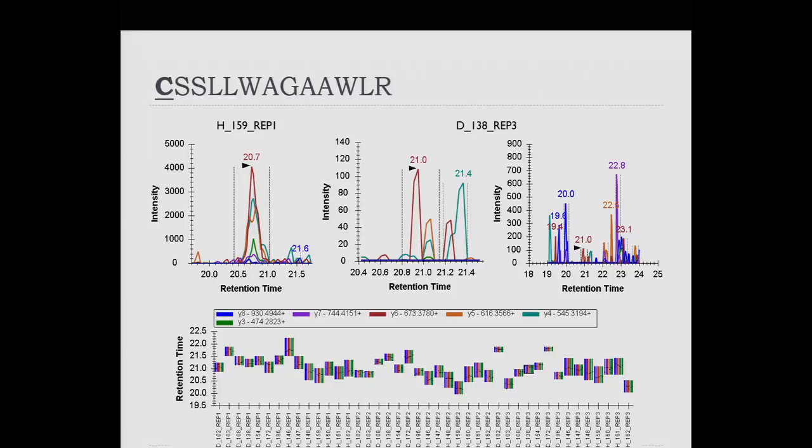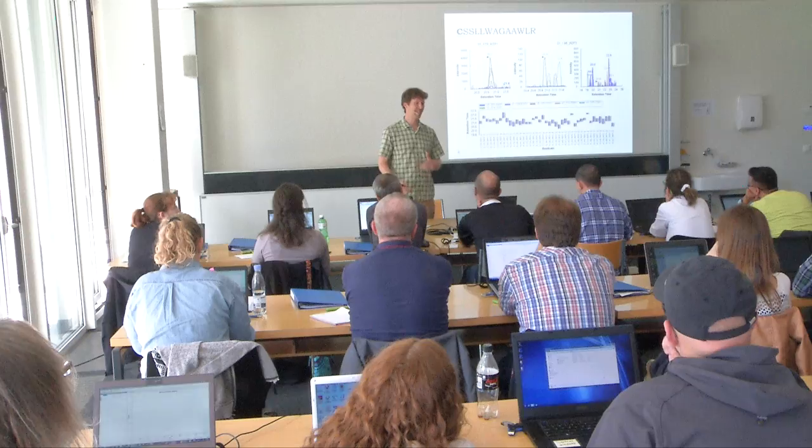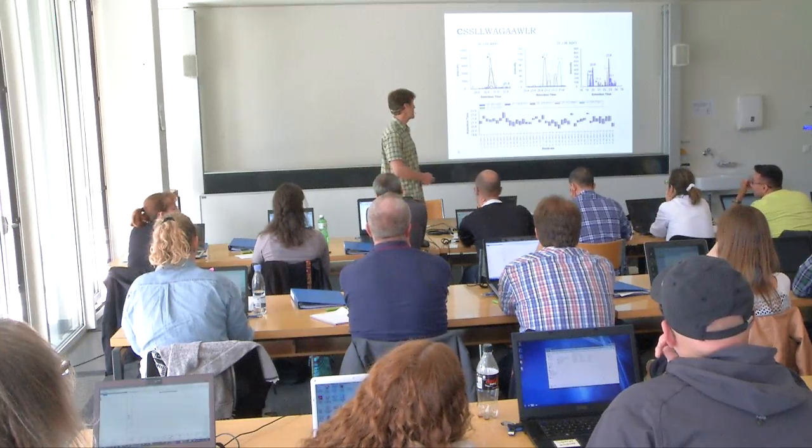But you can see that it's 102, 103, 108, and at least it's in cycles, right? But it's always disease before healthy, disease before healthy, disease before healthy, and everything's exactly in the right order. And so when Olga Vitek is here tomorrow, she's going to explain to you why you really need to randomize.